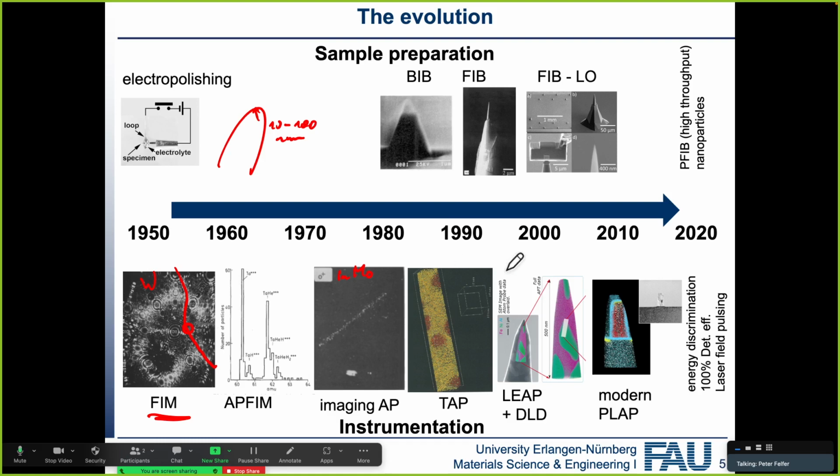So in the mid to late 80s, the first 3D atom probes came into play. Essentially in the early 90s was what we now see as a tomographic atom probe, and before that there was a position-sensitive atom probe. In the position-sensitive atom probe, the 3D aspect wasn't as widely used. And essentially that was done by our friends in Oxford, where the group is now headed by one of my former office mates.